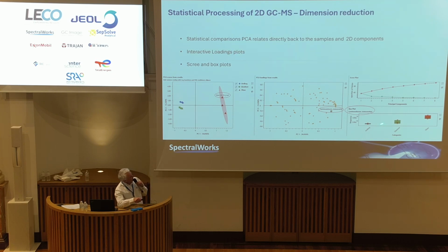And then, if you're looking at a difference here, look at the box plot at the end. You can see very, very quickly differences statistically from each of the samples that we're looking at, each of the categories. So it makes it something that's very presentable.